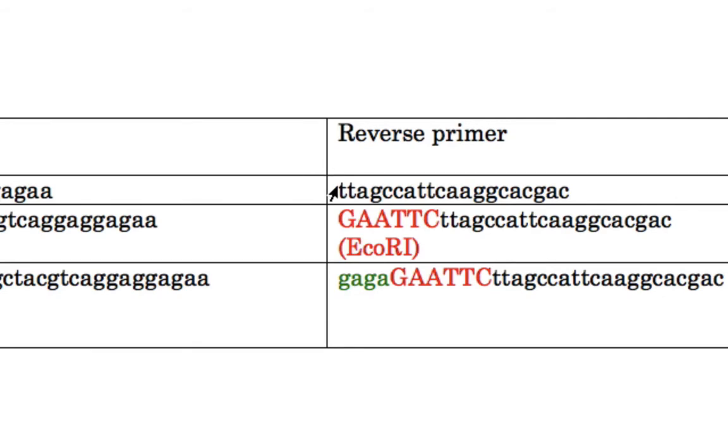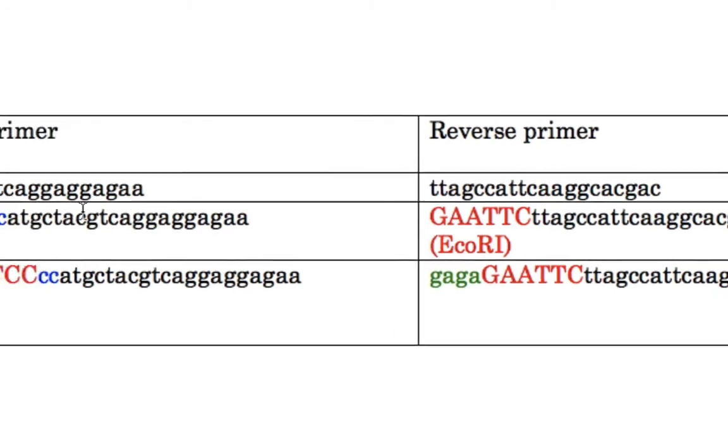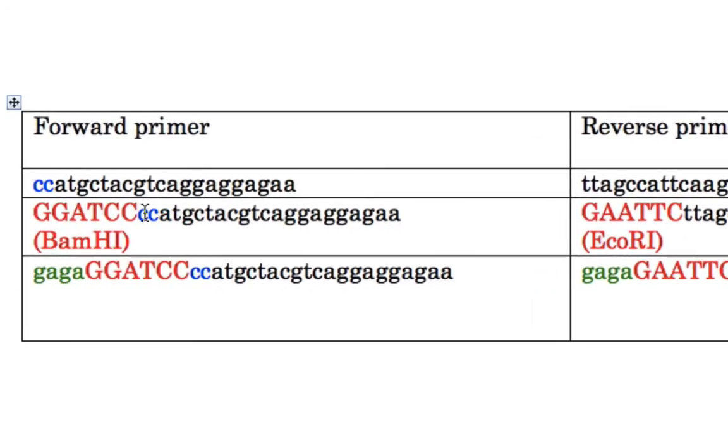All the changes need to be made in the forward primer when we want to fix the reading frame, right? And this time we'll add the BamHI recognition sequence upstream of the 2 extra nucleotides. So GGATCC before those 2 nucleotides, and then we'll add 4 more nucleotides just so that restriction enzymes can nicely cut. So this becomes our entire forward primer, and this entire region is the sequence which is not identical to the target sequence, while this part is identical to the target sequence BKK56G.